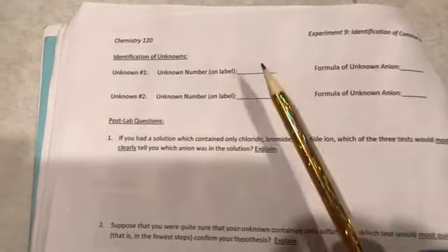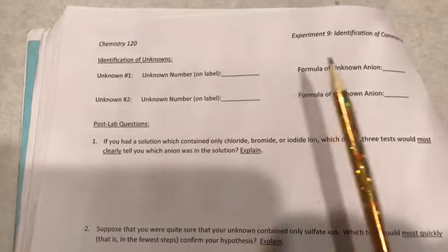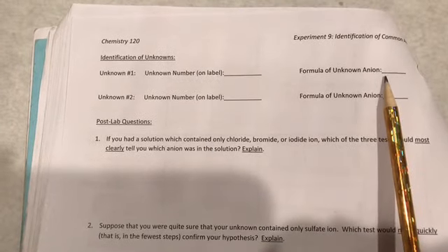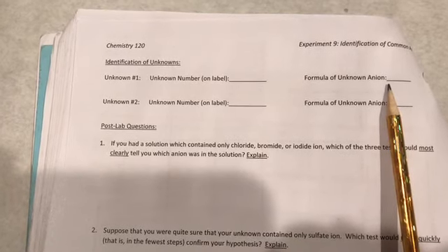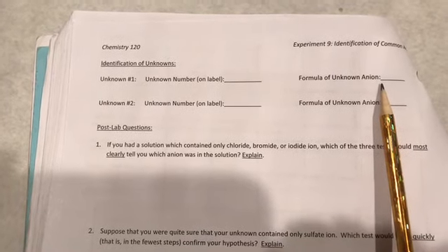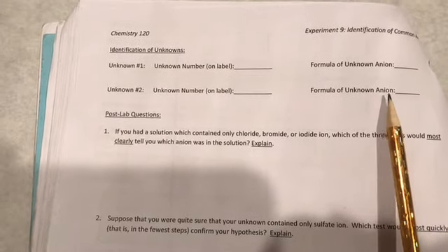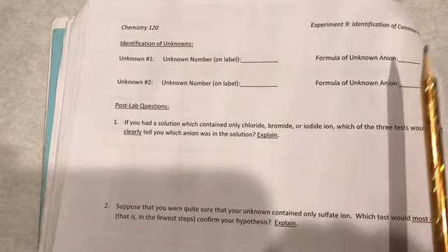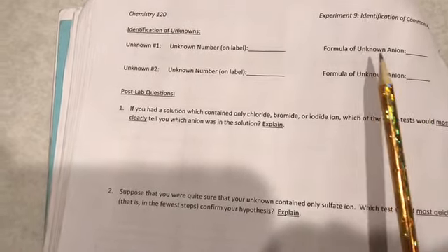You don't have to worry about the labels, obviously. Just leave it as such, unknown number 1 and unknown number 2. And then you are going to write the formula of the anion. That means if it is sulfate, you would write SO4 minus 2, phosphate PO4 minus 3, chloride Cl negative, bromide Br negative, iodide I negative. So you are not going to write the formula of the ionic compound, you must write the formula of only the anion.